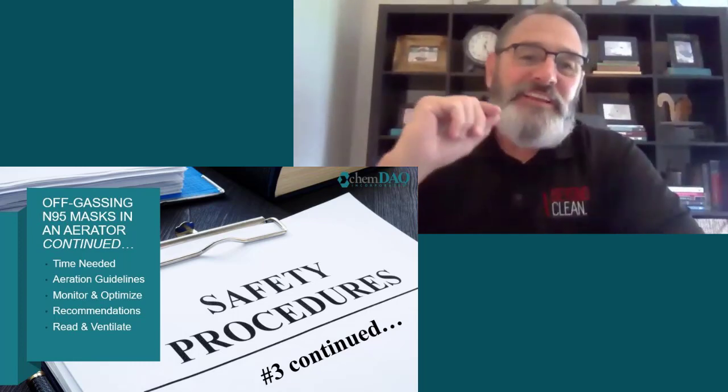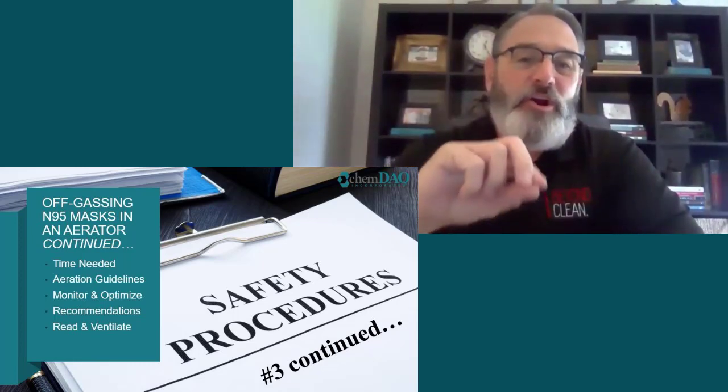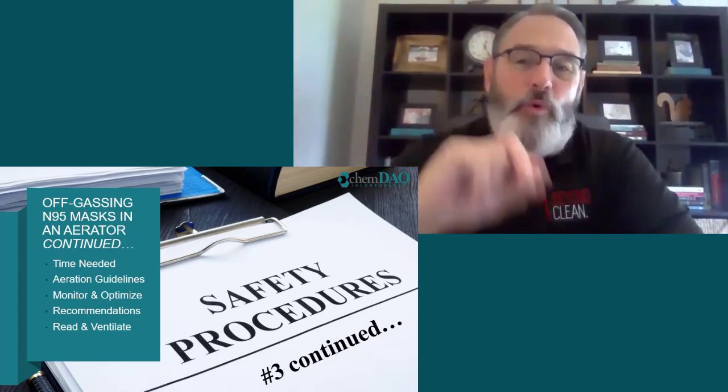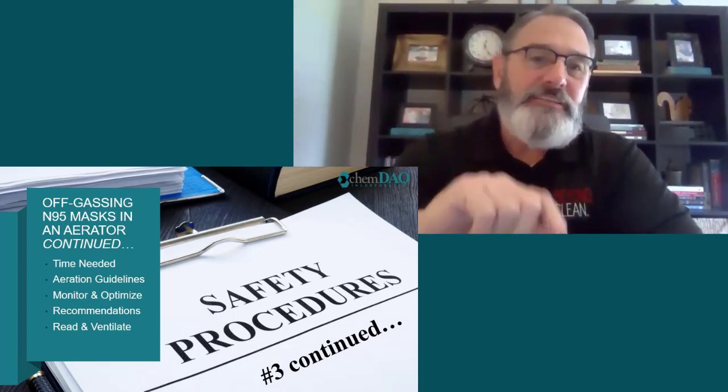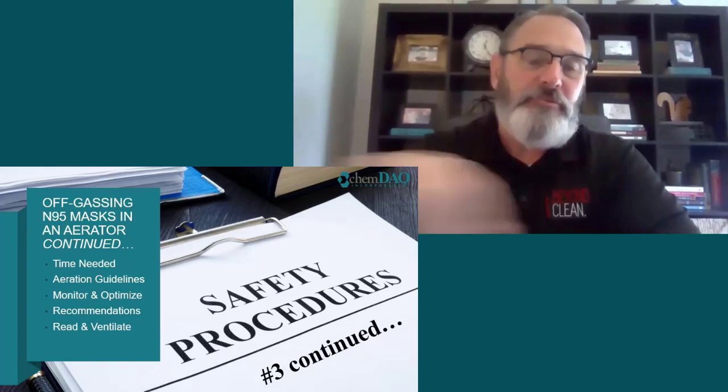Okay, so let me ask a big question here. Why is it not required to have area monitoring in healthcare facilities if we know that it's causing danger to their employees?